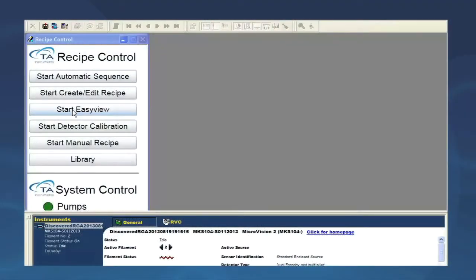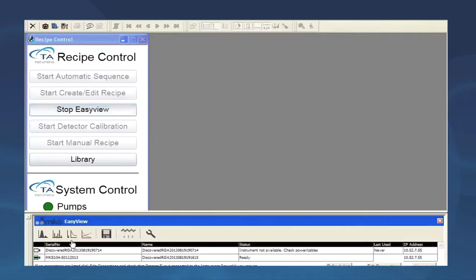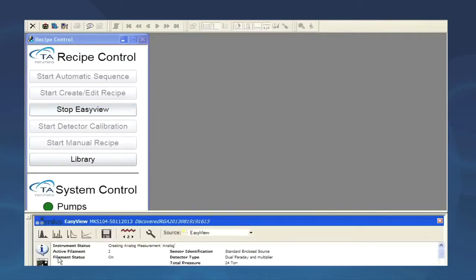Start by clicking on the start easy view button. Select the instrument to connect to. This menu appears.